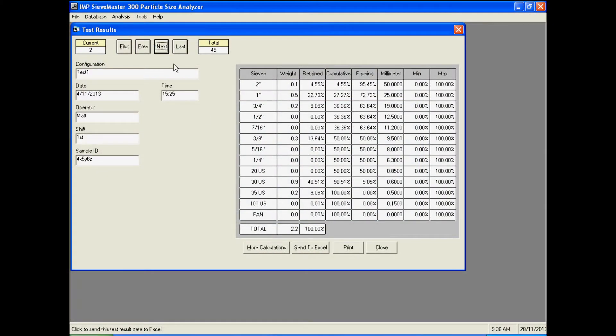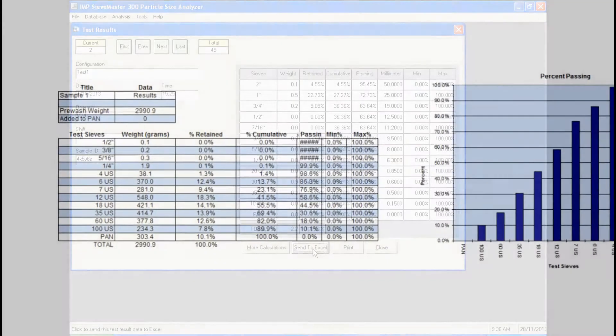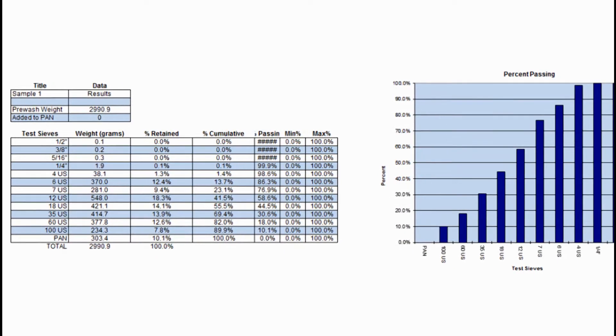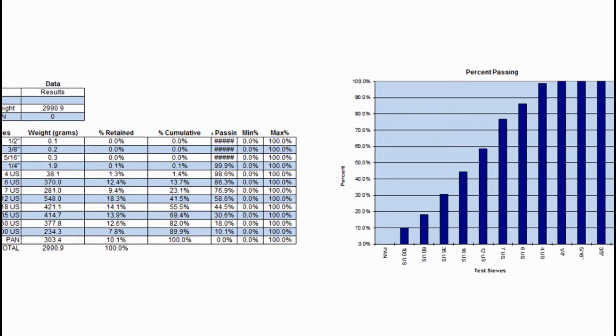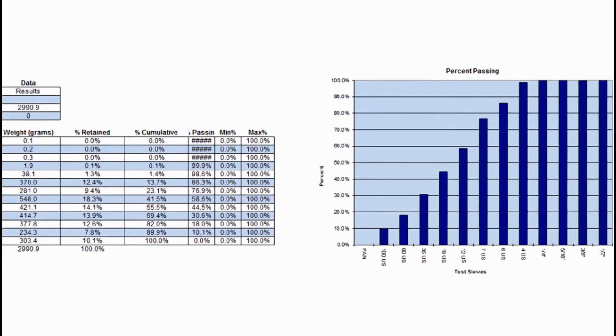Results are available immediately after the test with the data able to be output to Excel in a variety of different layouts.